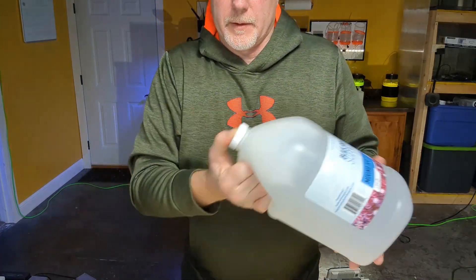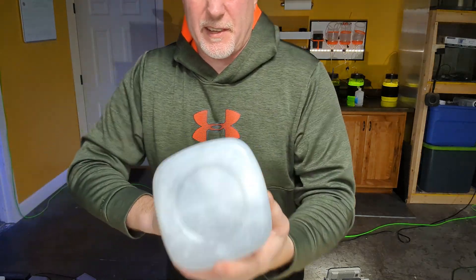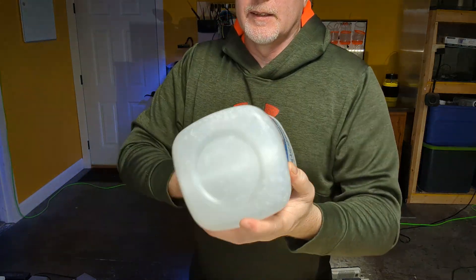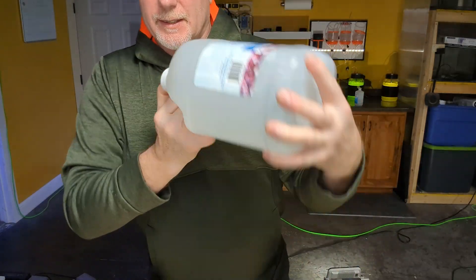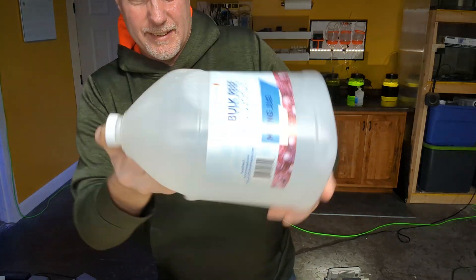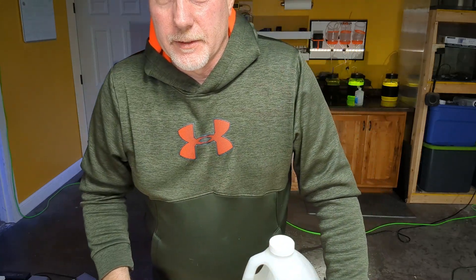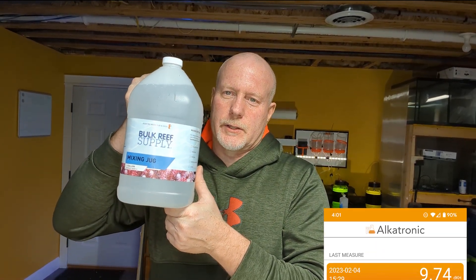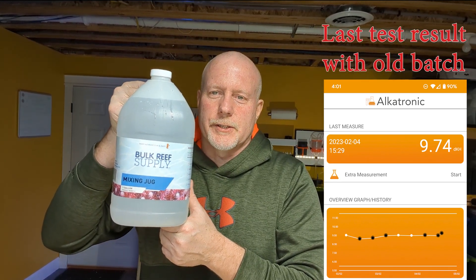Seal it up, put your thumb over the hole — this is all about safety. We're making a 0.01 molar concentration. I won't sit here and shake it for the three or four minutes I usually do, but we've just made 3.75 liters of Alcatronic reagent for not enough money to even give a second thought.